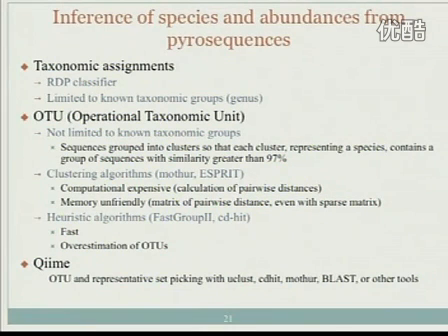It's not comparable to the human. I don't really know the exact size, but I think Greengenes is quite big. If you really just want to run BLAST, that will still take quite a while if you have a huge query data set.